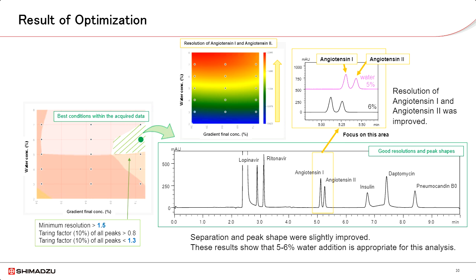Upon completing the extended gradient optimization and increased water concentration experiments, the design space revealed that increasing water was only effective to one further point, and that beyond 6% water, no additional gains in resolution were observed. In terms of gradient final concentration and slope of the gradient, very little effect on resolution was observed, with each being an equivalent choice.